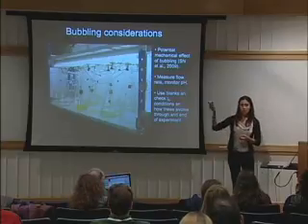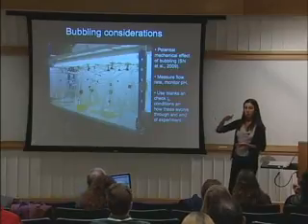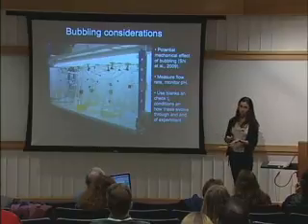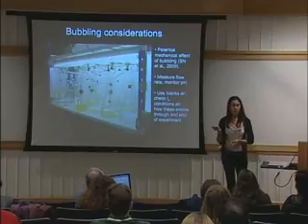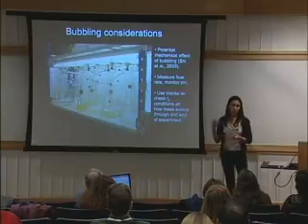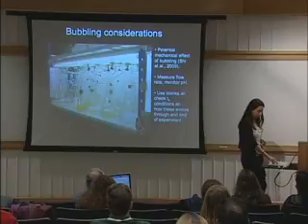We work with very high PCO2 levels in our gas cylinder compared to what we have in the bottle, so we end up with approximately half. When we want to achieve 750 ppm CO2, we are bubbling 1500 ppm CO2. So that gives you an idea. We just have an open system and bubble extremely gently to achieve the desired ppm.